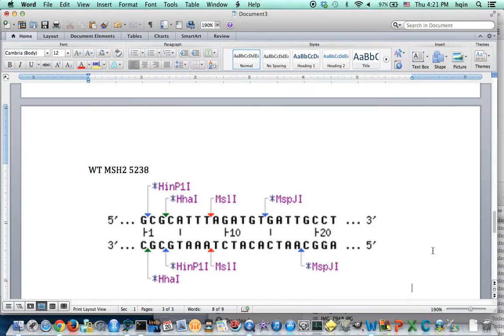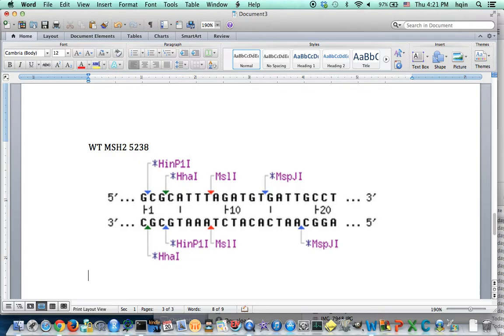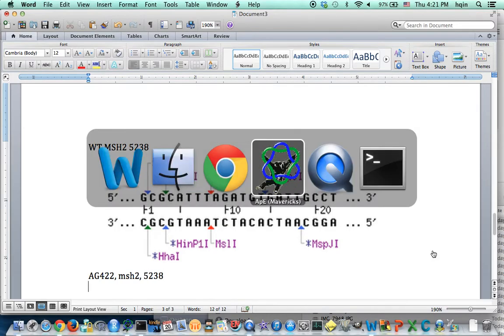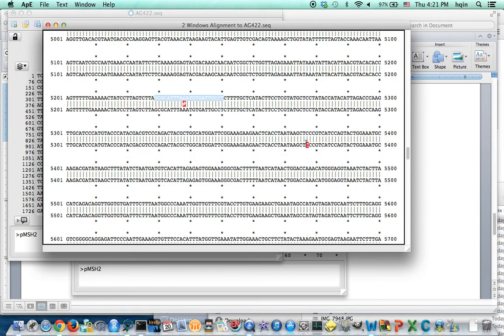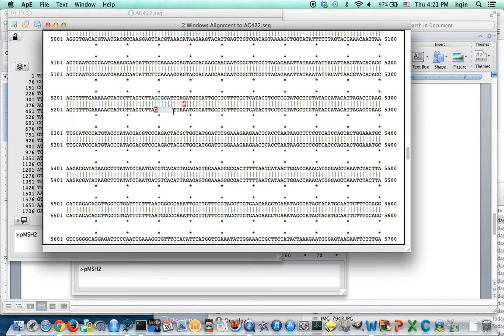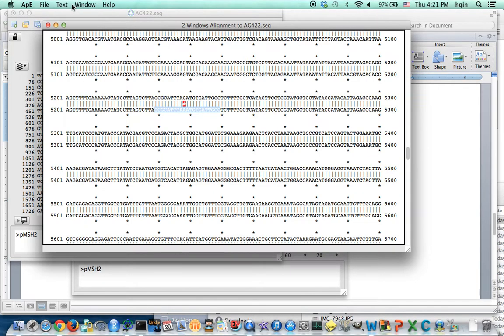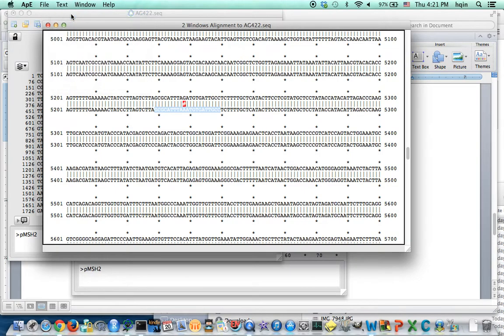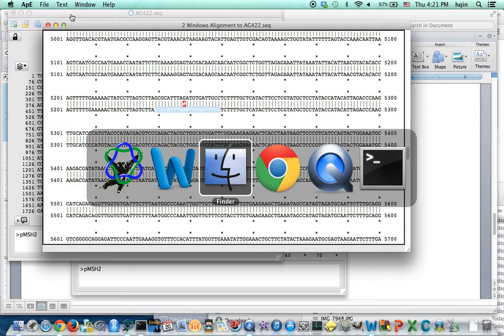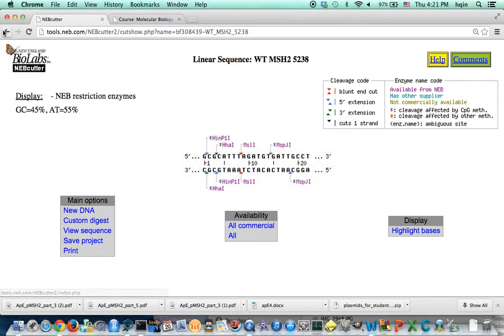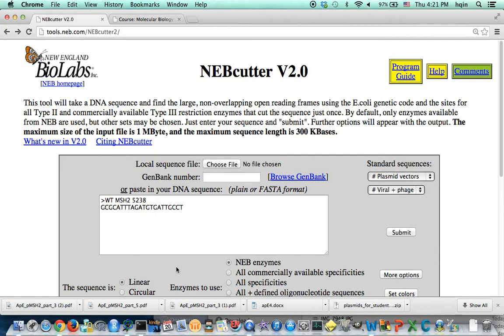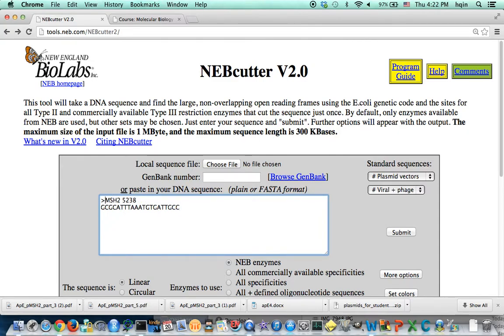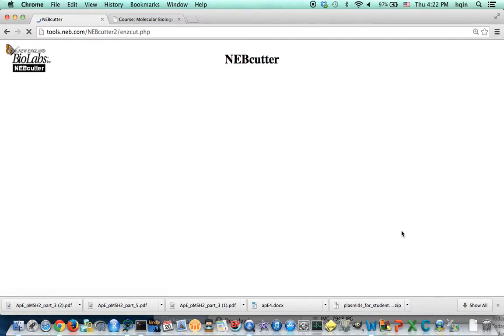And then I'm going to do the mutant AG422, mutant MS25238. I go back to APE, so I'm going to highlight the same sequences here. Approximately, copy, and go back to the NEBCutter. And this time I'm going to change this one to AG422, submit.